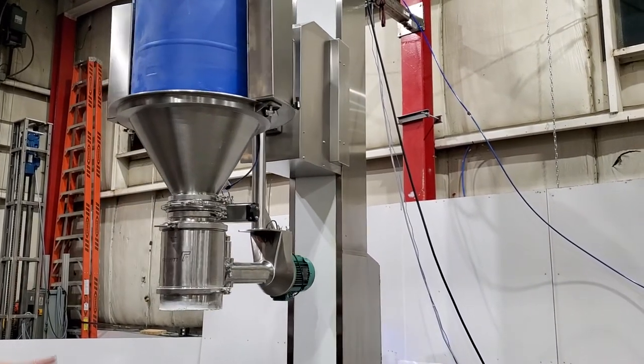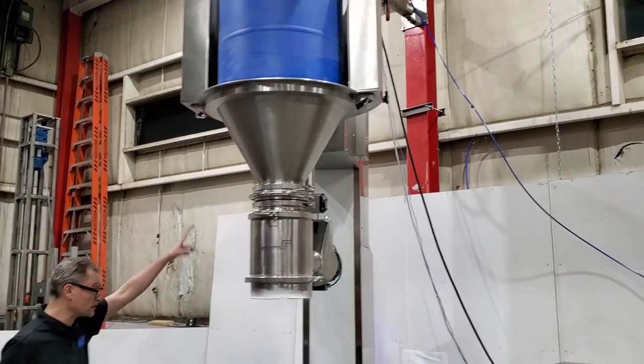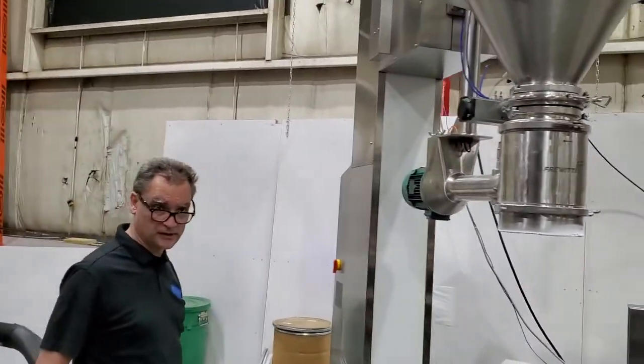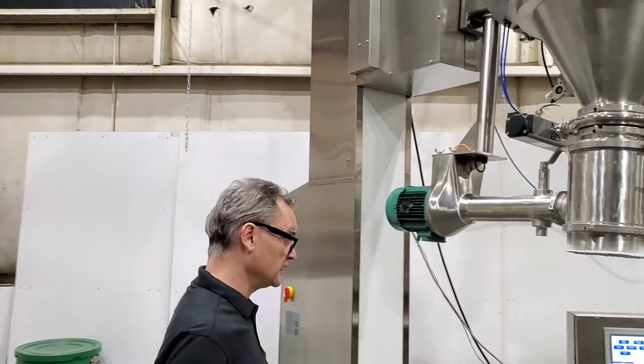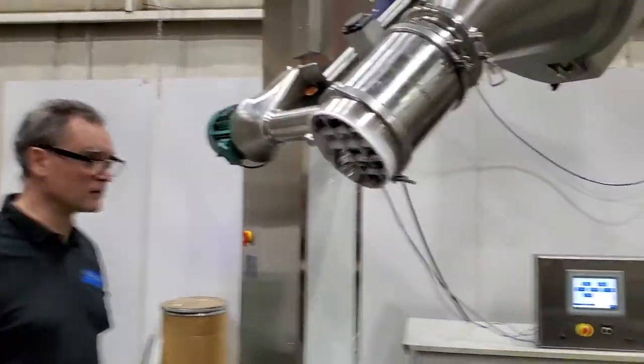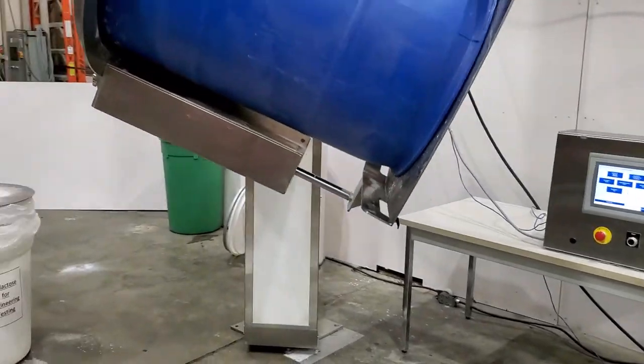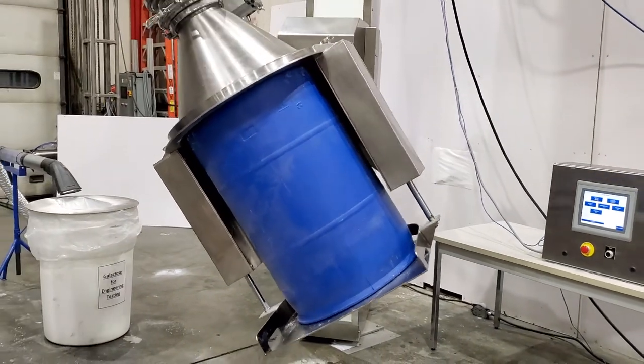All these positions are set just like the SLU, digitally. It's not stopping on limit switches internally — it's all software limit switches. It knows where it is at all times, and that's the only way to really get the positioning control this accurate.